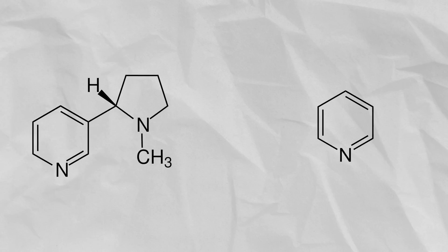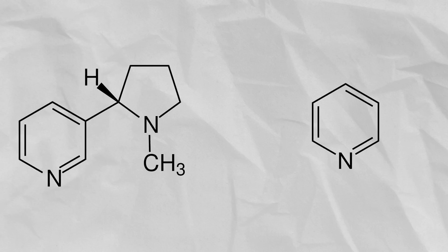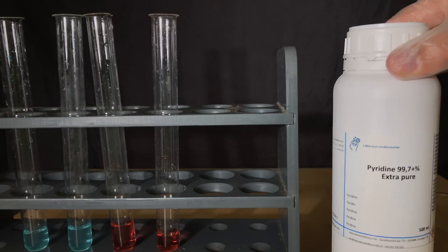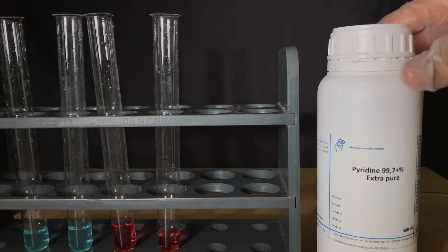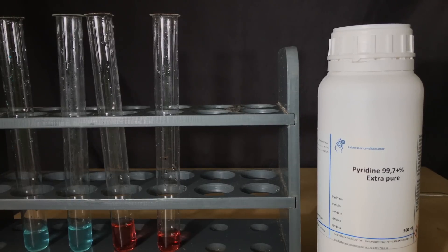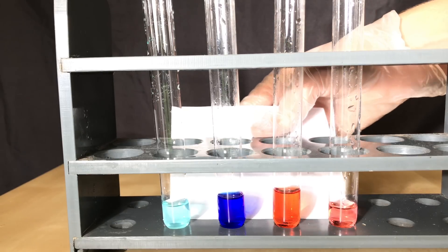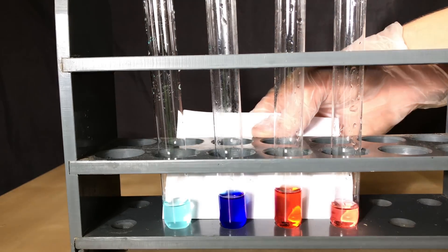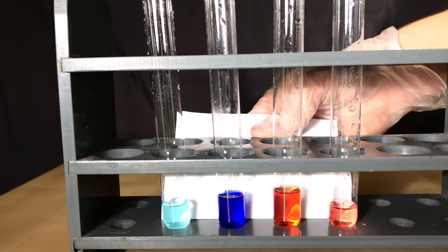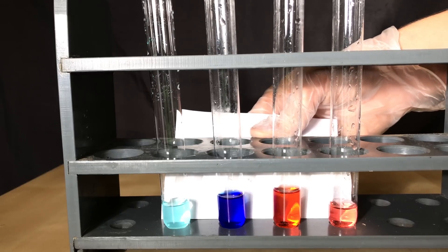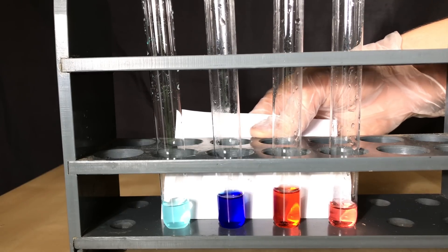Here's some nicotine in comparison to pyridine. I wondered what the pyridine complexes looked like, and there's only one way to find out. Fortunately, I got a bottle of pyridine from Laboratorium Discounter and we are going to use the pyridine to do the same as with the nicotine. Unfortunately I forgot to press record on the camera, but the middle two test tubes contain the pyridine complexes. The cobalt complex is a little red but it's not black as the nicotine one, and the copper one is a dark blue.